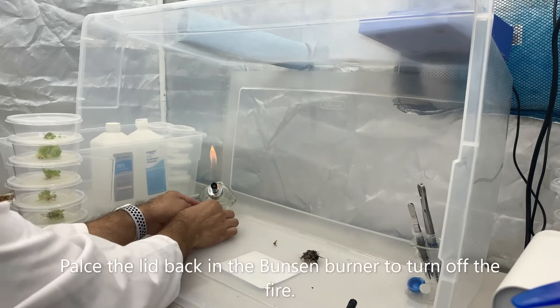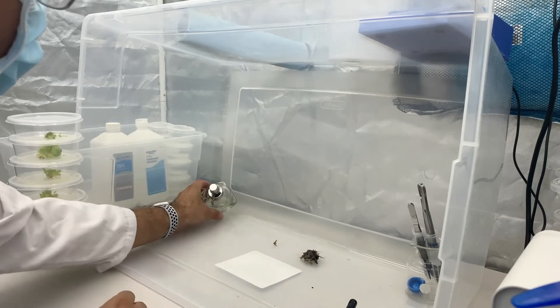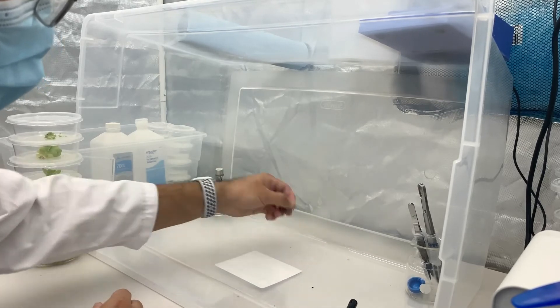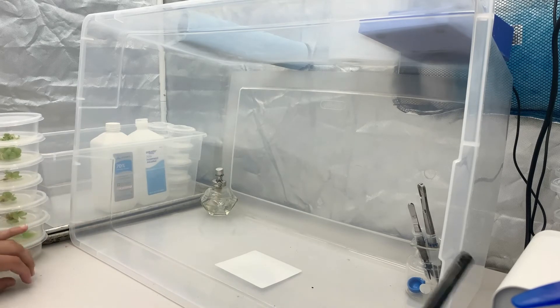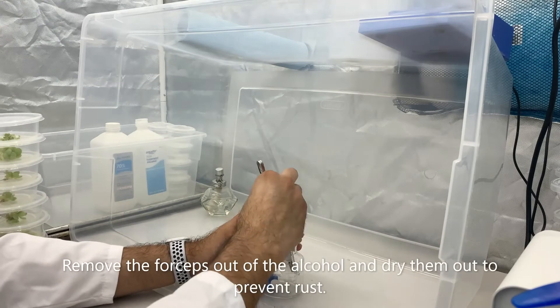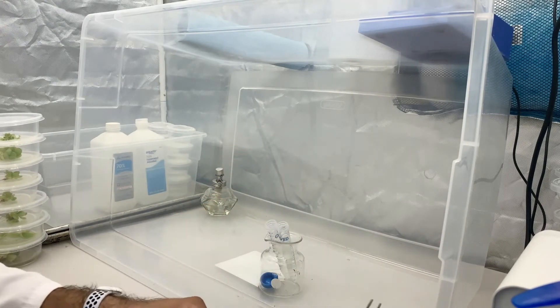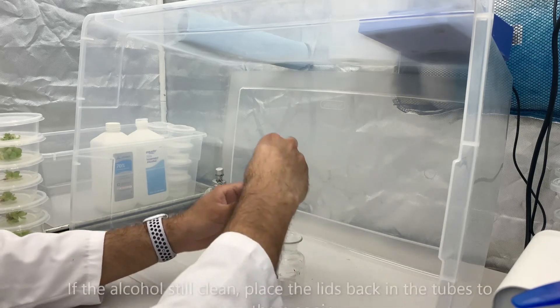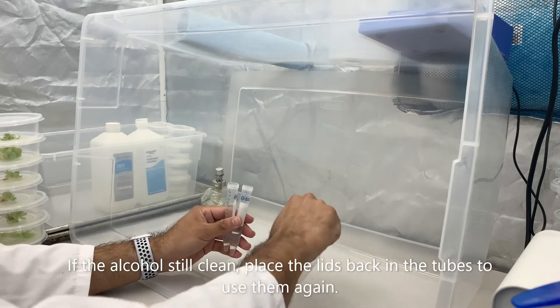Place the lid back on the Bunsen burner and turn off the fire. Remove the forceps out of the alcohol and dry them off to prevent rust. If the alcohol is still clean, place the lids back on the tubes and you can use them again tomorrow.